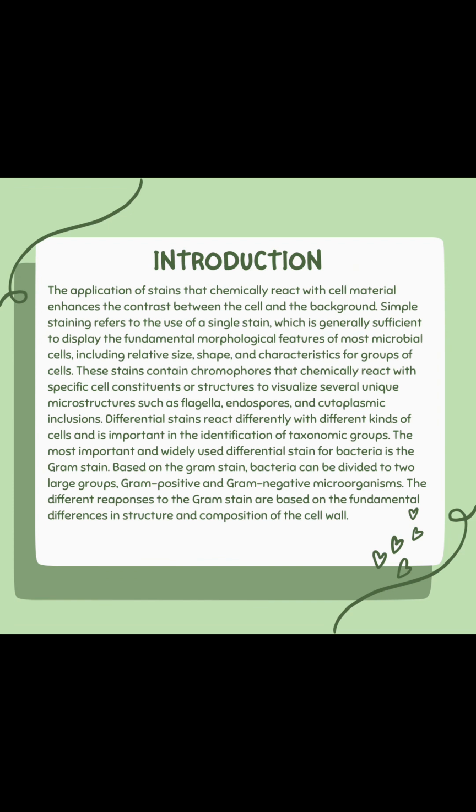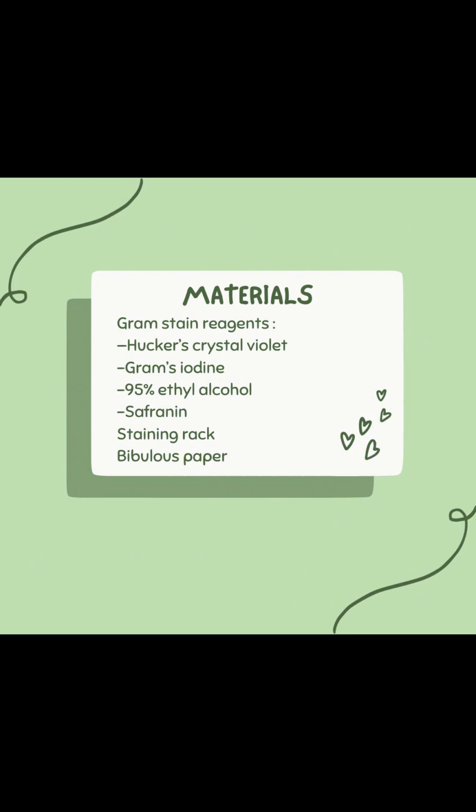Materials used in this experiment are gram stain reagents, Hucker's crystal violet, Gram's iodine, 95% ethyl alcohol, safranin, staining rack, and bibulous paper.